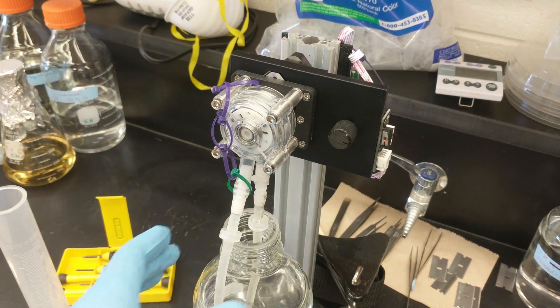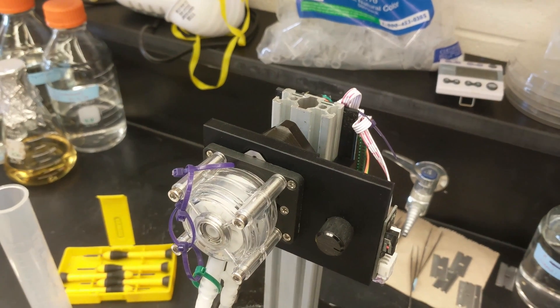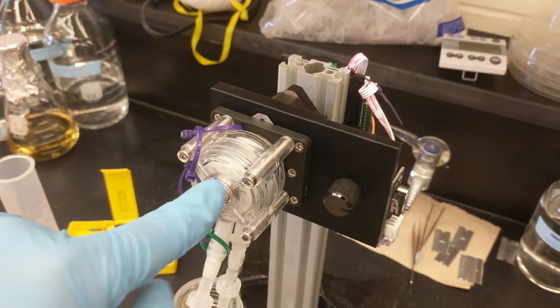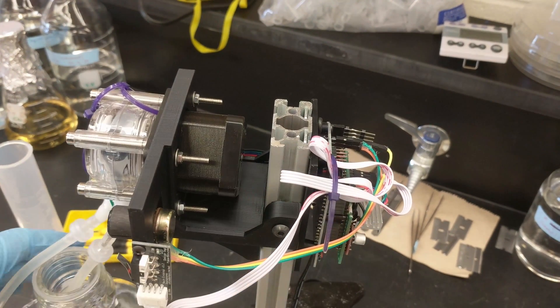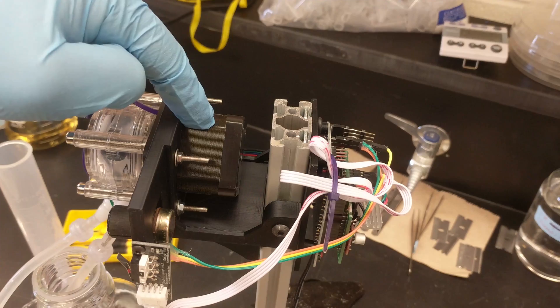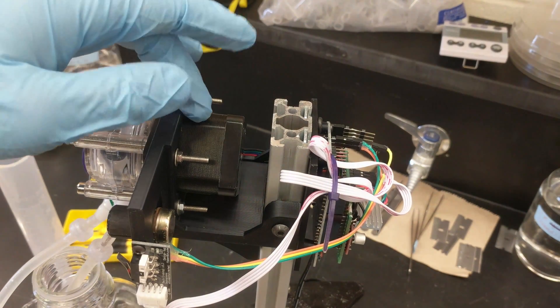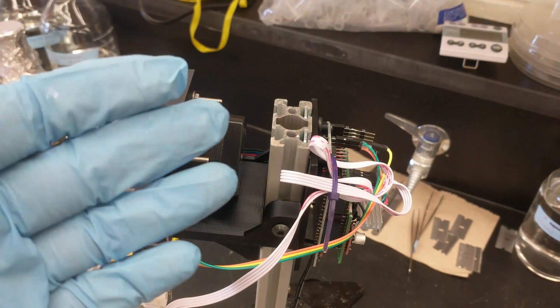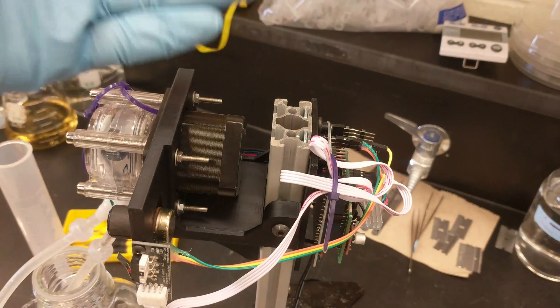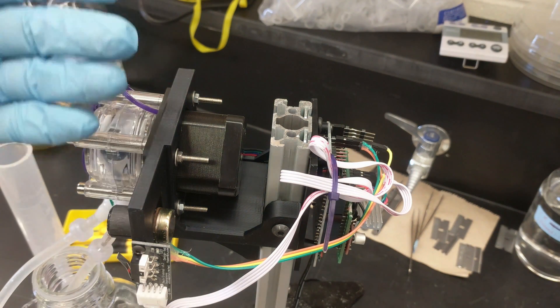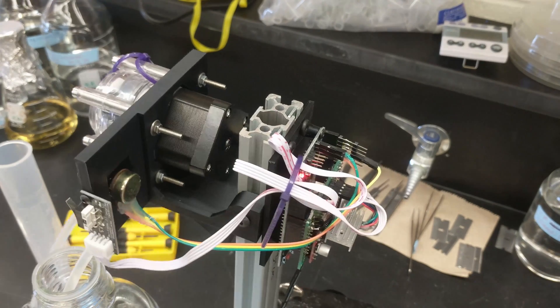So essentially all it is is a medium-sized peristaltic pump, and it's controlled by a stepper motor so you get accurate control versus what you could get with just a regular DC motor. This provides an amount of steps that you can tell it to move so you can dispense accurate volumes.